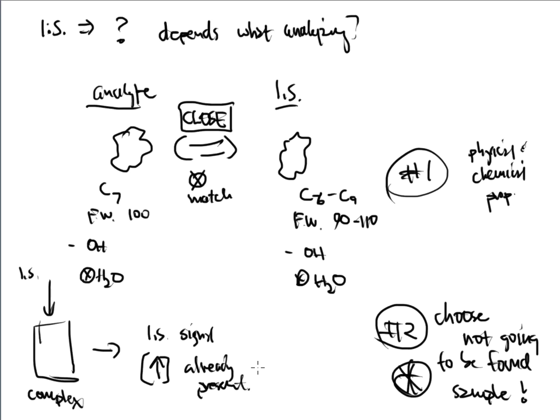I'm going to think that there's only one milliliter of internal standard that I've added into that sample. When in actuality, there's more because it was already present before I added another one milliliter inside. So I have to make sure that the sample does not have this particular type of compound on the inside.